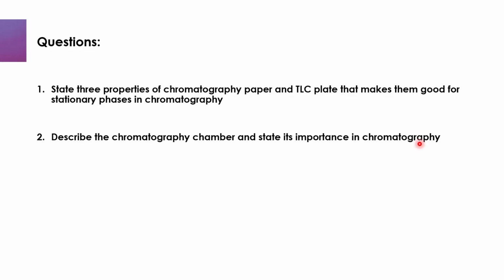These are some questions I would like you to try your hands on before coming into the lab. 1. State 3 properties of chromatography paper and TLC plate that make them good for stationary phases in chromatography. And 2. Describe the chromatography chamber and state its importance in chromatography.